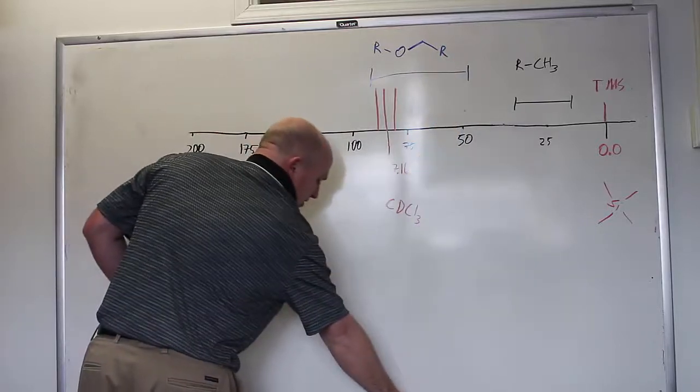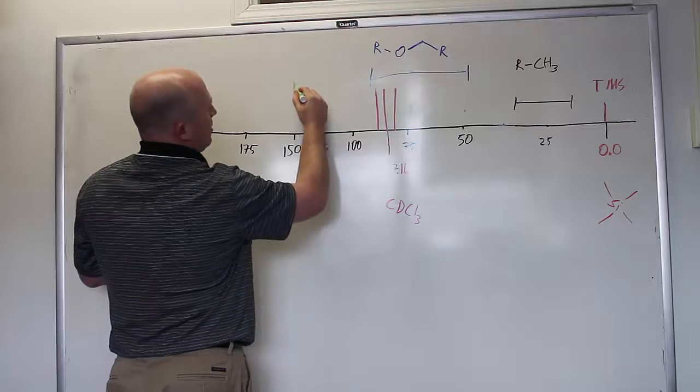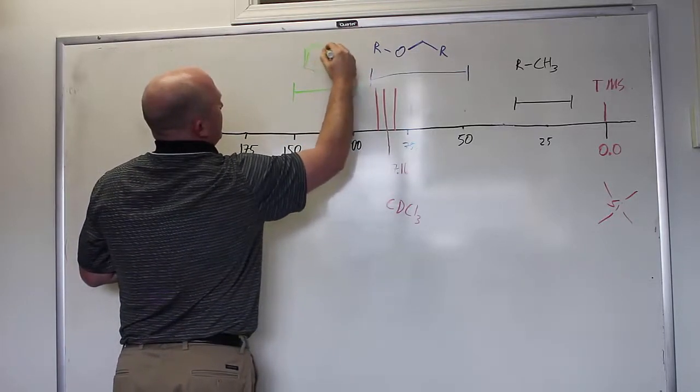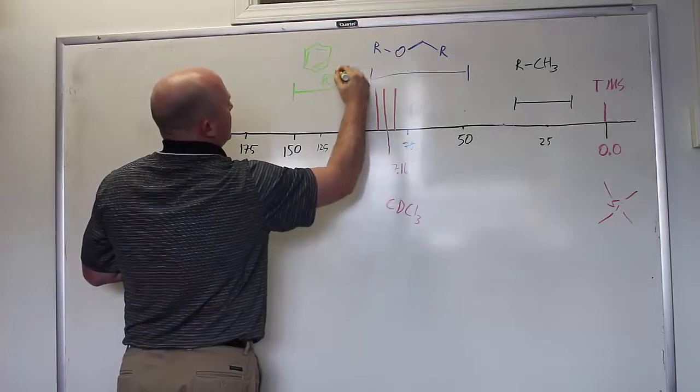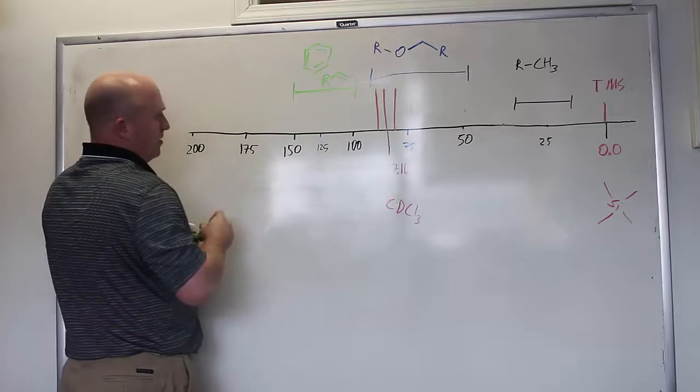Another region of interest in C13 spectra is the double bond range. Here there's no distinction between double bonds in rings like benzene and isolated double bonds. Carbon-carbon double bonds show up in the range between 100 to 150.